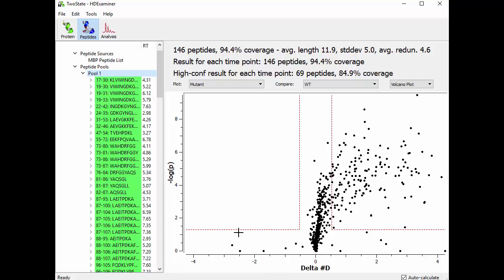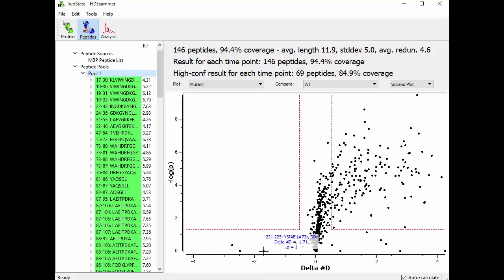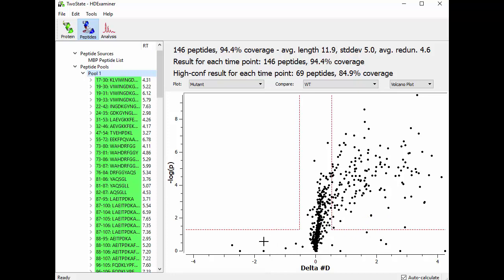we make sure that the low value points, so the good P values, are actually higher up on the graph. And the things that are lower on this Y axis are the ones that we don't want because their P value is too high.